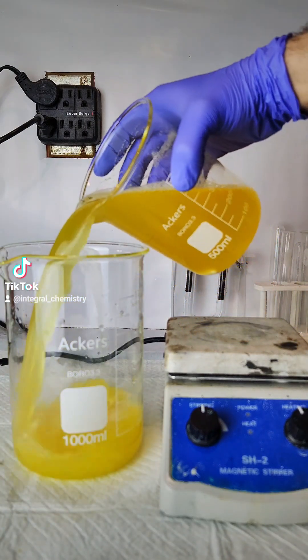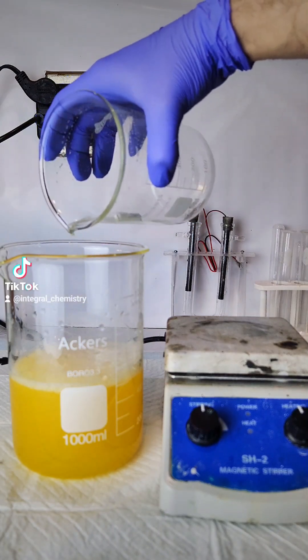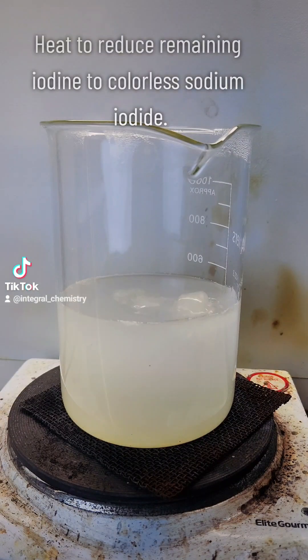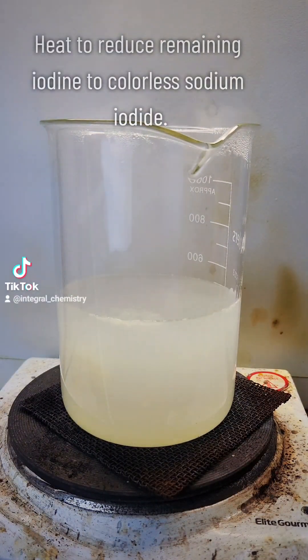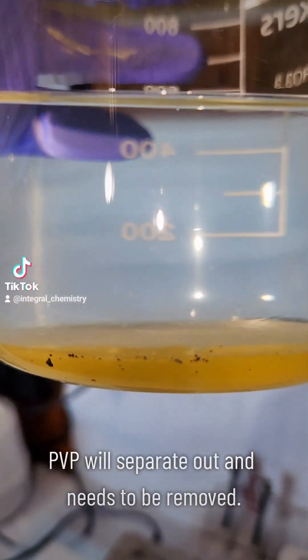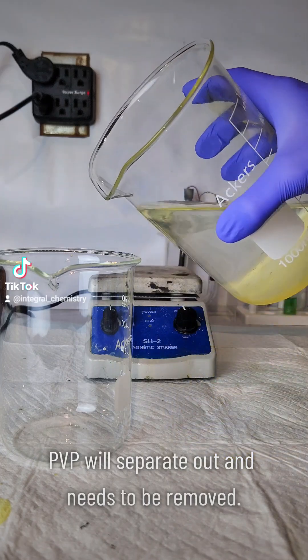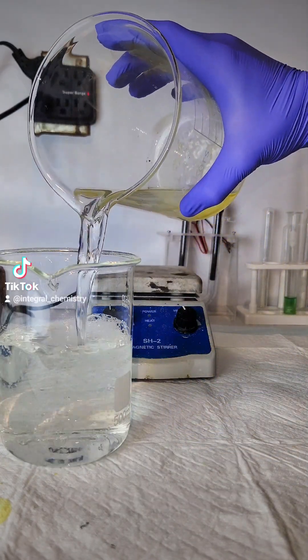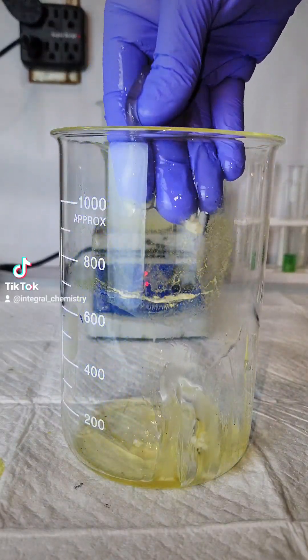You'll notice that the solution I have here is yellow, while sodium iodide is colorless. The reason for that is that at room temperature, iodine is not able to fully react with sodium hydroxide, and some of it stays suspended in solution. Fixing this is pretty simple — all I do is put it on the hot plate for a while, let it cool, and once it's cooled, I notice that a lot of the povidone has settled out of solution. To get rid of it, I simply decant off my sodium iodide.